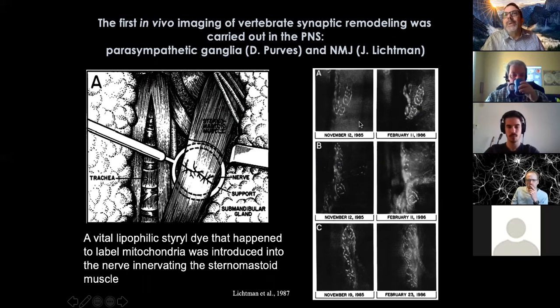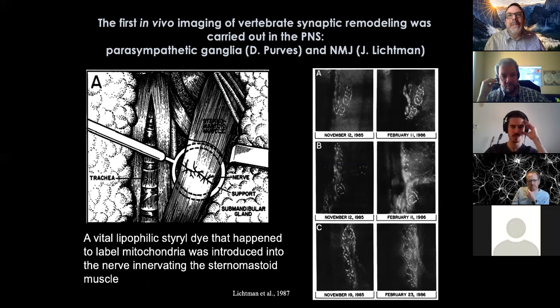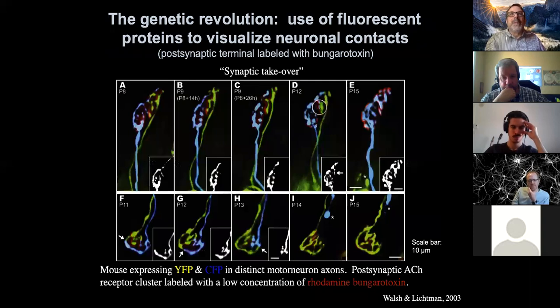One of the things I love in this paper is that they give the dates on which they were able to image repeatedly at the same site. You can see that many months apart, they are able to go back and find the same structure at that synapse. This was pioneering work, and it allowed them to make a lot of conclusions about what happens at synapses during development. But really, this kind of work took off with the advent of genetic tools, in particular the use of GFP and GFP derivatives to label motor neurons and neurons in general.